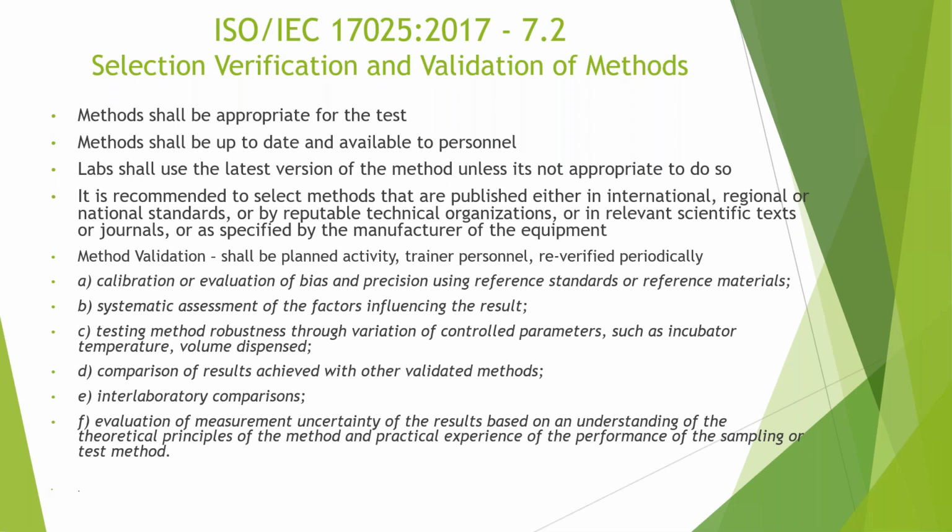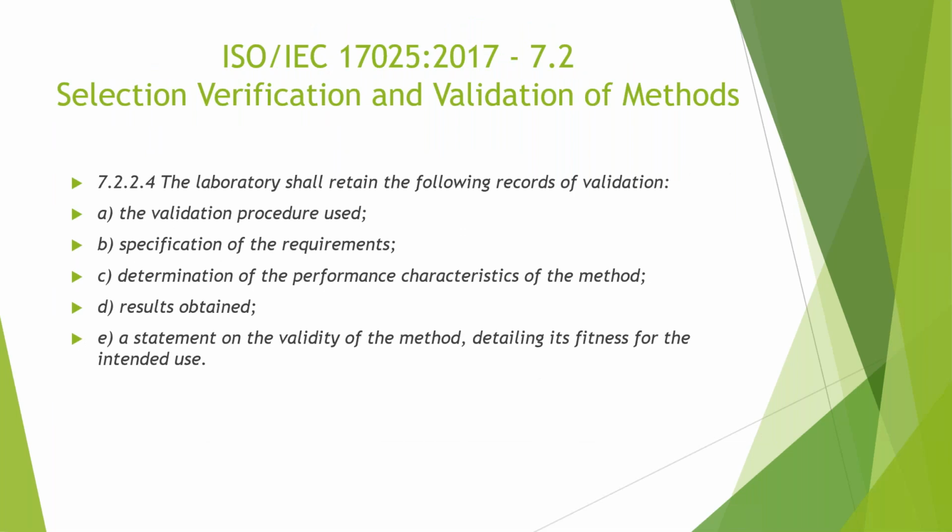Continuing on, 7.2.2.4 of the validation of methods criteria in 17025 does ask for specific things in regard to validation. Here they're listed; this comes right out of 17025. Again, having a validation procedure, the specification of those requirements, determining the performance characteristics, understanding the results obtained, and a statement of the validity of the method. So it is a lot of work that goes into validating your methods.